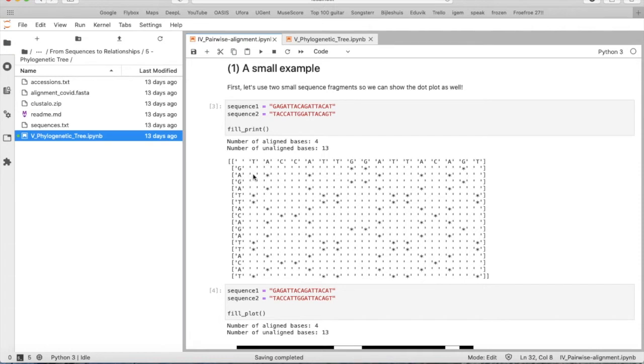And we see here that all these crosses correspond to a match. There's a cross, A, A, it's a match, A, A, it's a match, and so on. Also see, there are four bases aligned to each other, and the other 13 are not aligned.